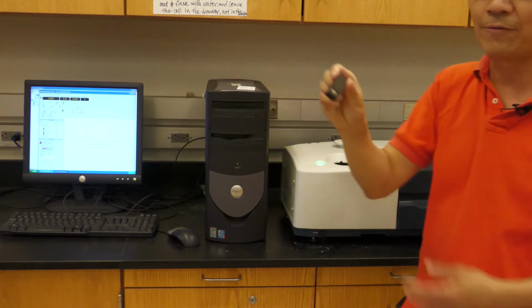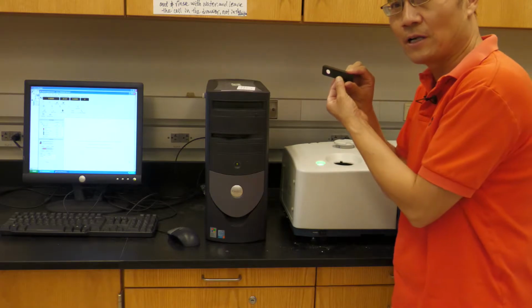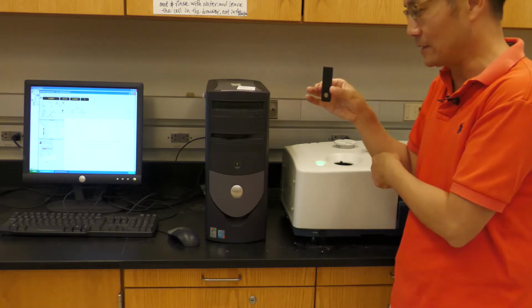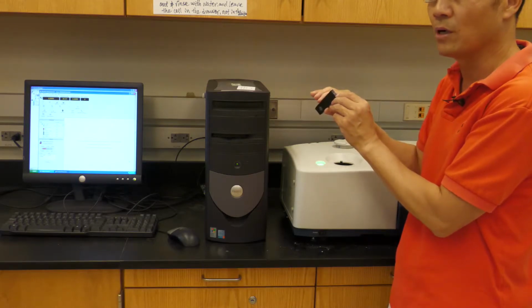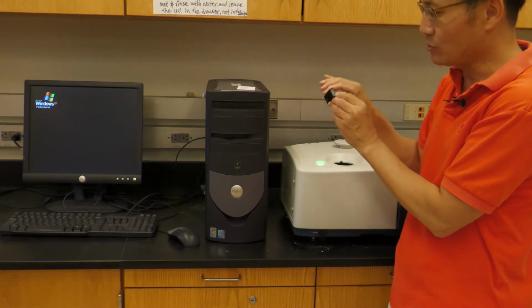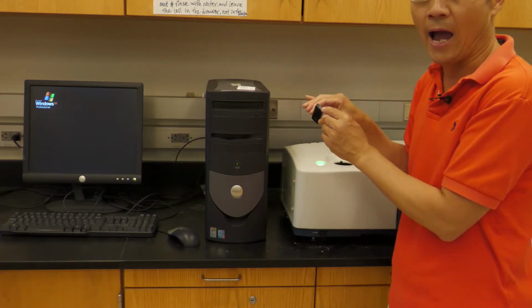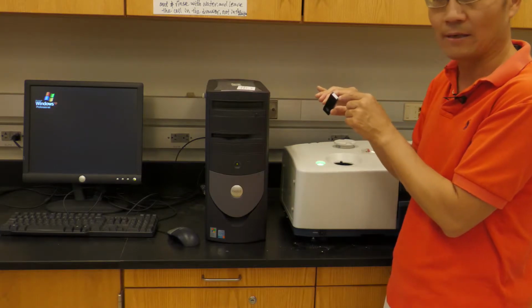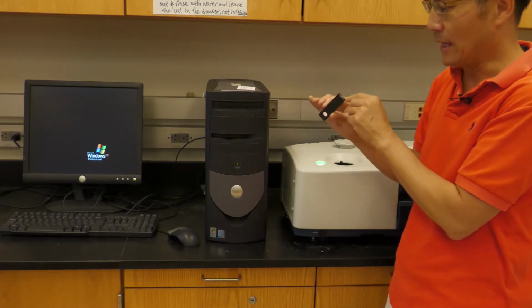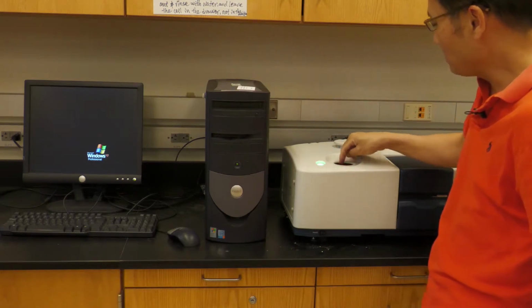So this light, we will filter this light. We use a filter. So the filter gives a single wavelength, so that is a single color, monochromatic. Okay, so this wavelength is 589. So this one is exactly as the sodium light. Okay, sodium light is 589. So that means the regular light passes.